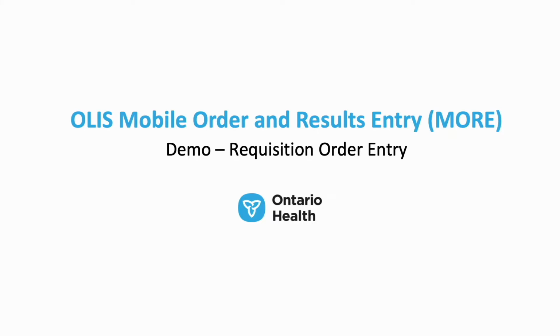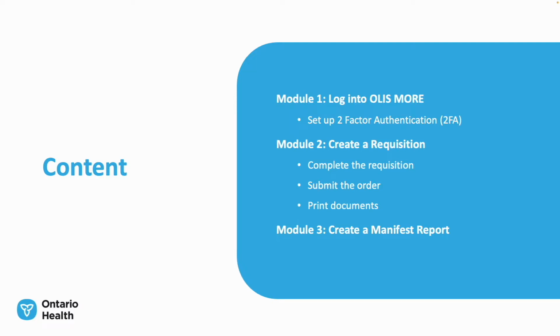Hi, and welcome to a demo of the OLIS mobile order and results entry system, also known as OLIS More. This video is specific to COVID-19 test requisitions. This video will provide an overview of how to use the More system, including how to log into More, how to create a requisition, as well as how to create a manifest report.